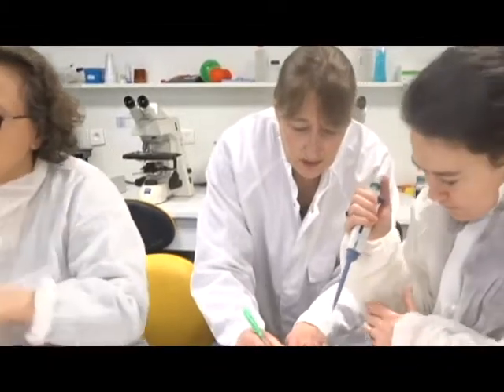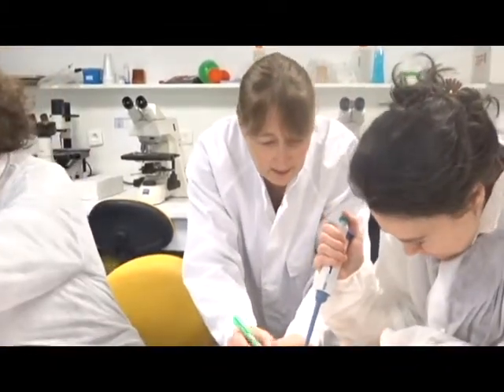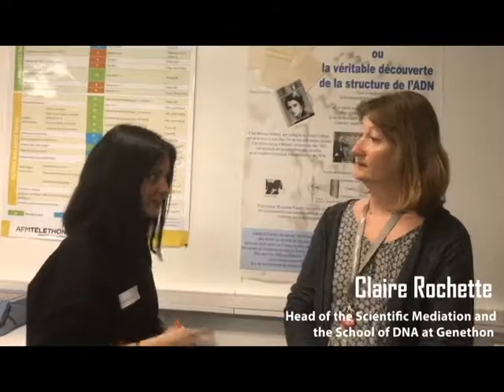Claire Rochette, a scientist at Genethon, speaks in more detail of the experiments we did in the 3 days and their lead-up to learning about gene therapy. Did a lot and learned a lot for these 3 days. Yes. Before we even got to the topic of gene therapy, there was a lot of other concepts we had to cover first. Can you summarize just briefly, I know it's hard, in a minute or two, what we did here? We started with learning about cells and chromosomes and DNA.